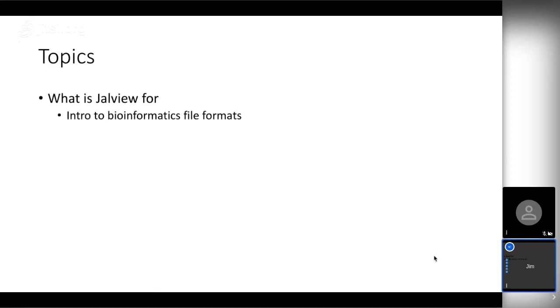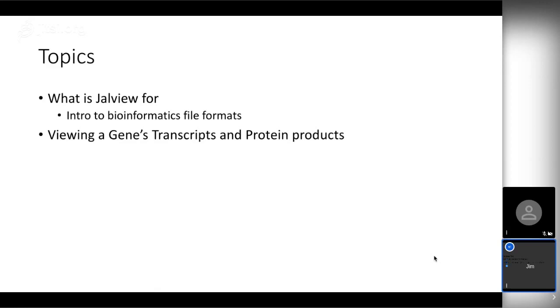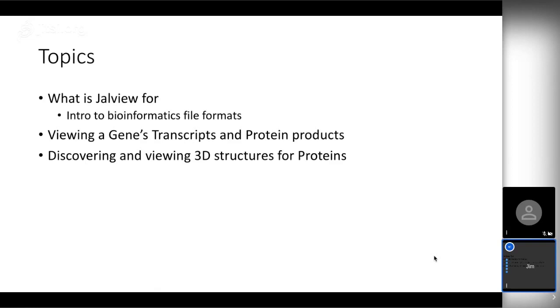So I've been talking for about half an hour. What I've done is walked you through Jalview, from the gene through to looking at the 3D structure of a protein product and examining the variants in that structure. The 3D structure helps, but you often have to be a chemist or structural biochemist to really know what's going on. But there's enough information from the databases to tell you where the business end of the protein is — so you can often work out there's a variant near the active site that might mean something, or there's a ligand that binds and might be important therapeutically.